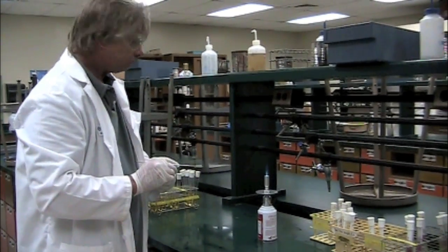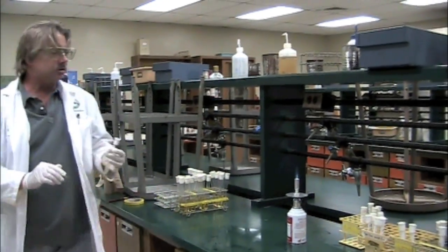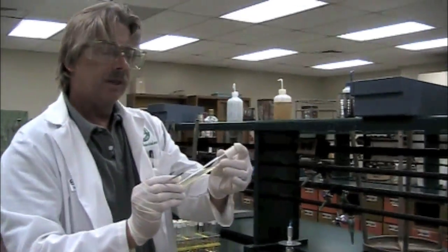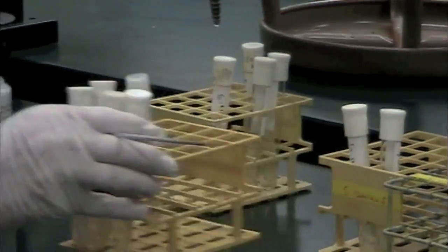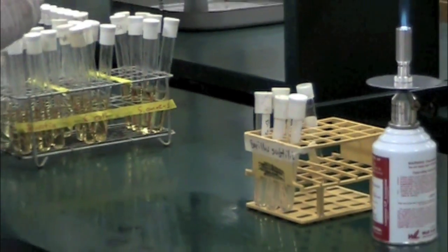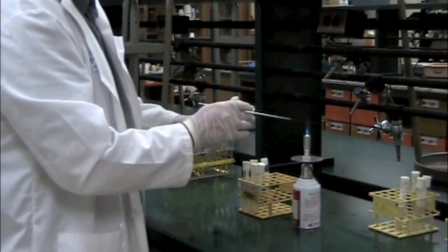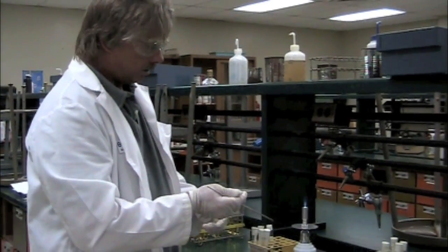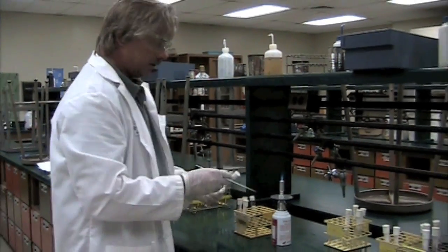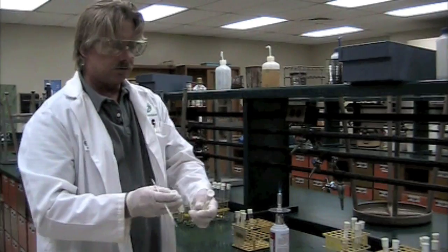Let me make a quick check. I need to make some slants of Bacillus subtilis, okay, for you guys to work with. Here's my organism, B sub. I'm going to scoot it over here into my area where I can work. And the first thing I need to do, all right, I've already sterilized my loop. Now I need to flame the end of this tube, and the end of this tube. This is my organism. This is my sterile tube.